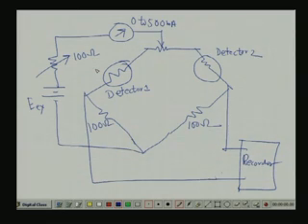the hydrogen flame ionization detector is used. That is a different thing. Okay, we will discuss that also. So, two detectors are being used. You see, we can have 4 detectors also, 4 detectors in one block itself, right. It looks like this. You see.